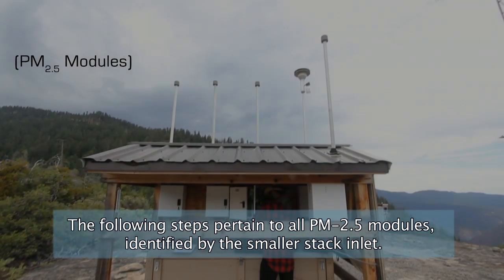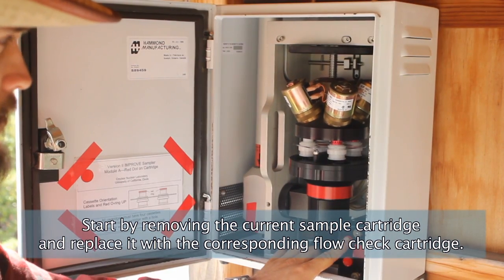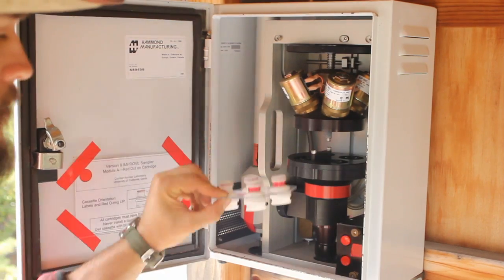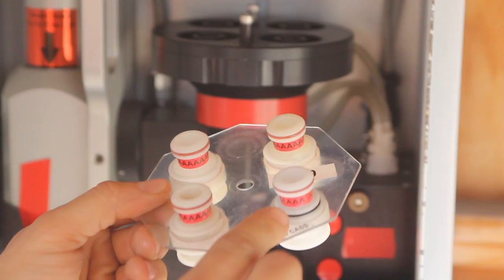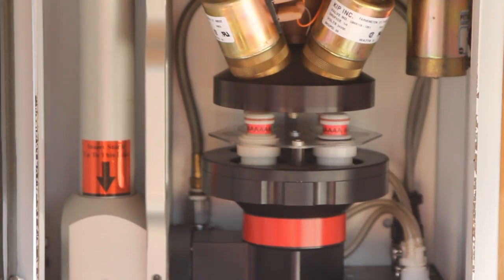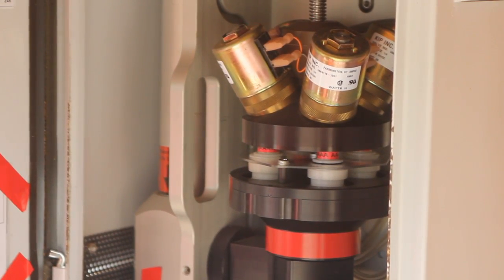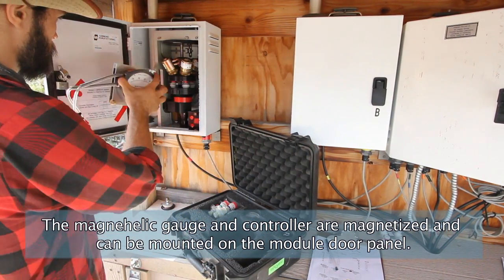The following steps pertain to all PM 2.5 modules identified by the smaller stack inlet. Start by removing the current sample cartridge and replace it with the corresponding flow check cartridge. Use the two reference holes to properly orient the cartridge. The Magnehelic gauge and controller are magnetized and can be mounted on the module door panel.